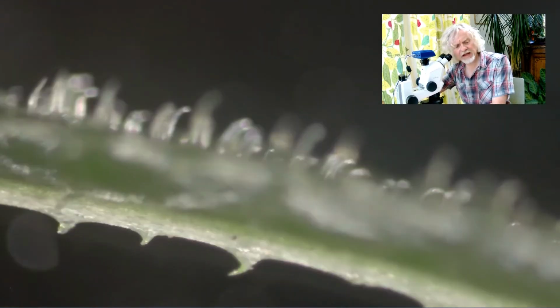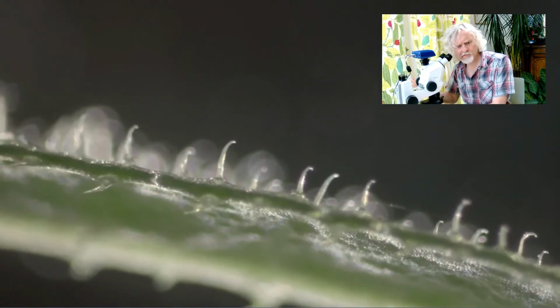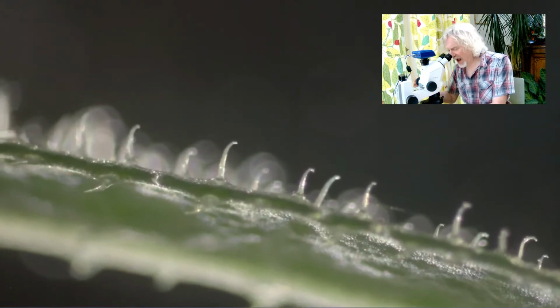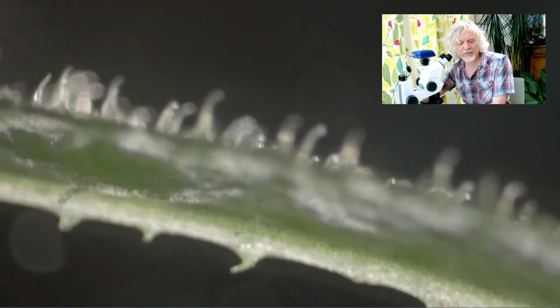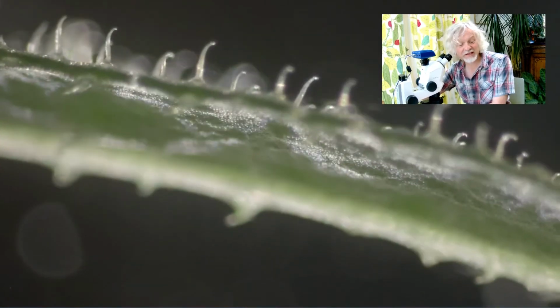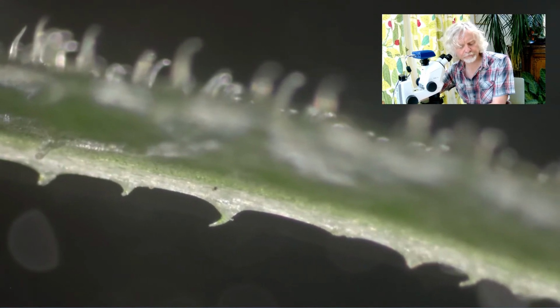And they're all pointing, depends on how you're looking at this, to the right of the screen. And the hooks on the underside are all pointing to the left of the screen. So there are definitely 2 different types of hooks on the surface of sticky grass or cleavers or whatever you want to call it.